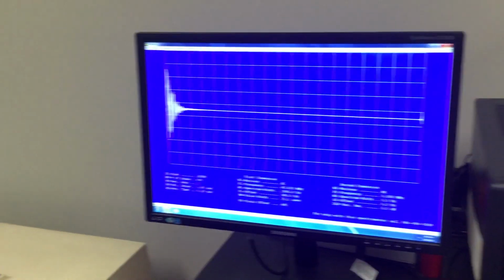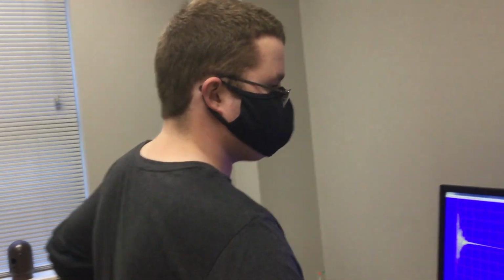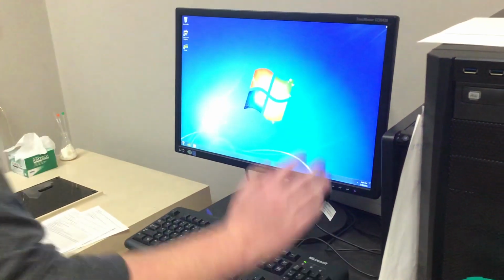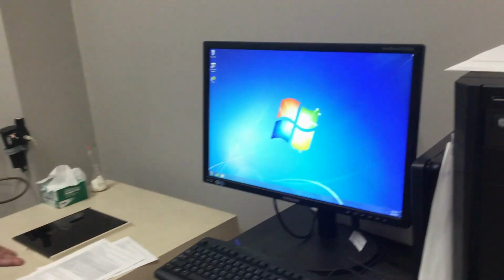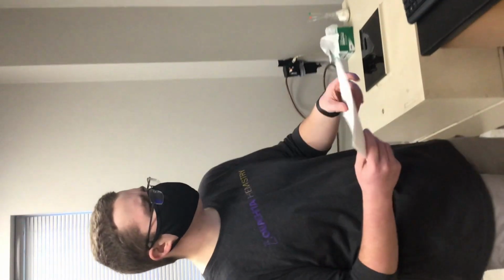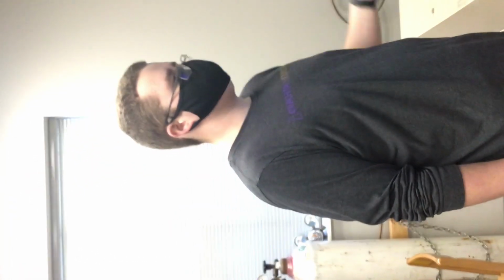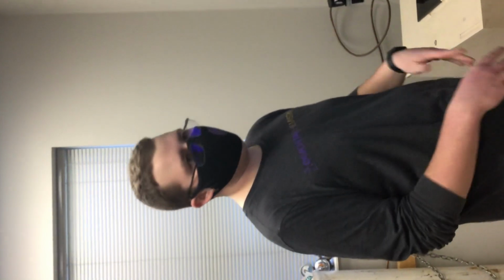So this system, as you've probably seen already, is a little finicky. So if this is on and people have been running NMRs already, it would probably do you good to close everything out and then reopen it again. Because sometimes, I don't know what happens on the inside, but sometimes it'll compound on itself, and then it doesn't like to run anything anymore, or it'll run the wrong program. So if you run into any problems, it's probably a shimming problem, or it's probably some kind of internal thing that would just be fixed by closing everything off and then reloading it and then redoing your NMR.